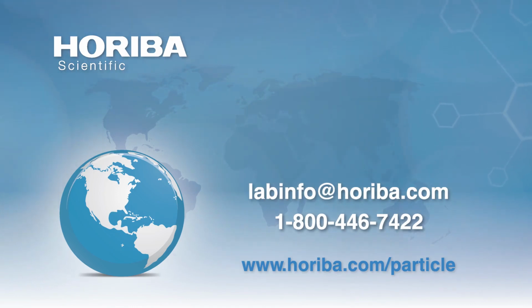Okay. Next one, how much process understanding is needed in early clinical stages? Okay, I guess that's going to me. So yep. Process understanding, I guess it depends on whether you're talking about the fluidized bed or the Icon 2. I'm not sure which way to take that, but for the Icon, for dynamic image analysis in general, and certainly the Icon 2 for that matter, not a whole lot.